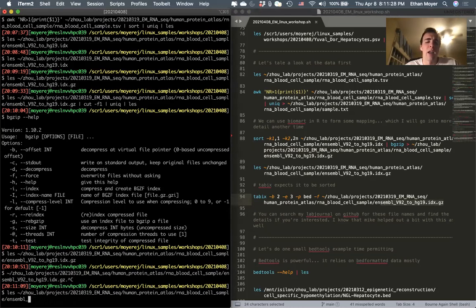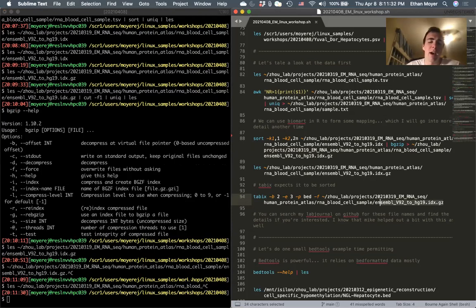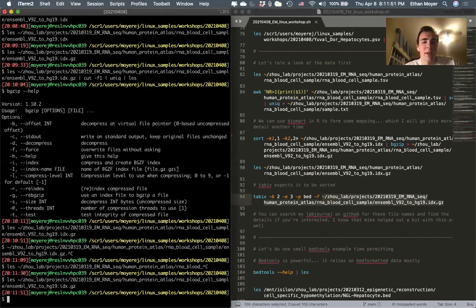I think the TBI file is a binary file that tbmate uses. So you take the non-TBI file, the one that we generated, the one that looks like this, send it to tabix to create the TBI binary file, and that's what you use in tbmate.